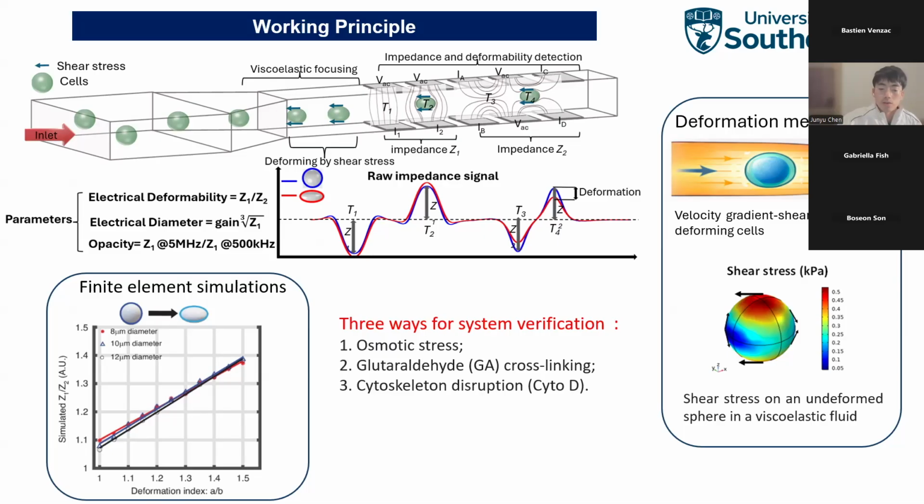The simulations show the electrical deformability, defined as the ratio between Z1 and Z2, is almost independent of the particle size and is linearly proportional to the optical deformation index, the ratio of the major axis to the minor axis.